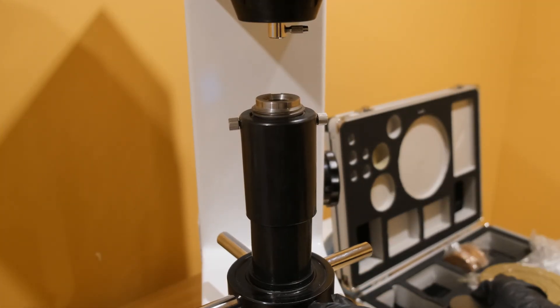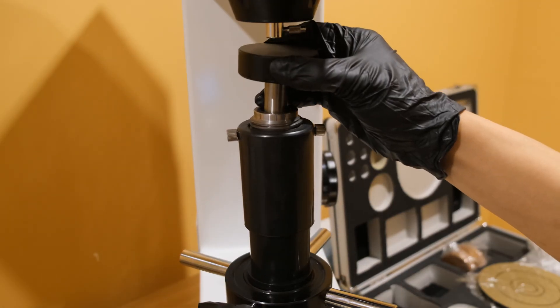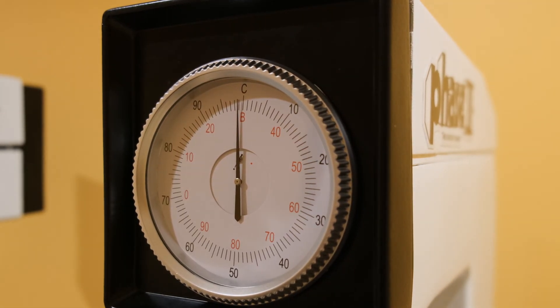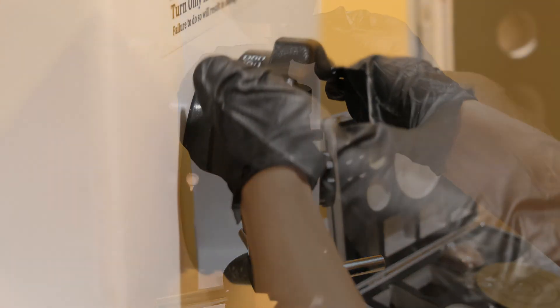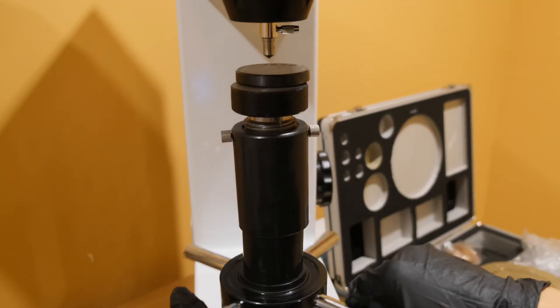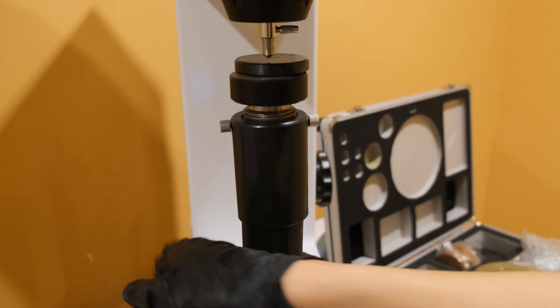To begin testing, ensure that an appropriate anvil has been installed such that the sample can be mounted firmly in place. Check that the indicator is in the proper position, one to two points behind top dead center. Ensure that the correct penetrator and weight have been selected, then place the sample and verify that it is stable.